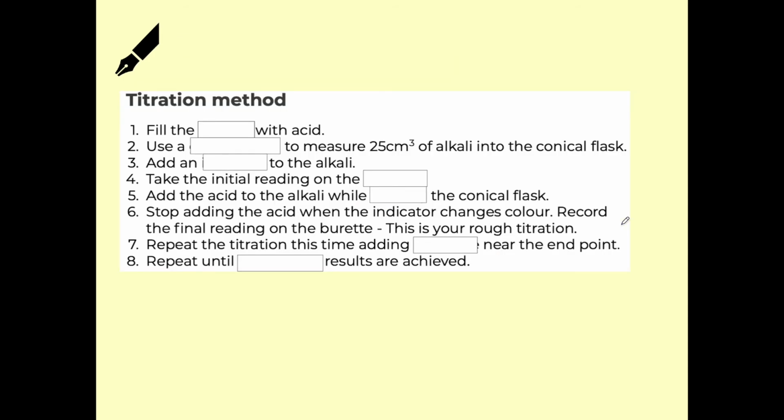Next, we're going to be considering the titration method. So can you pause the video whilst you fill in the gaps, thinking about the different pieces of equipment and the different processes which you do during this titration.